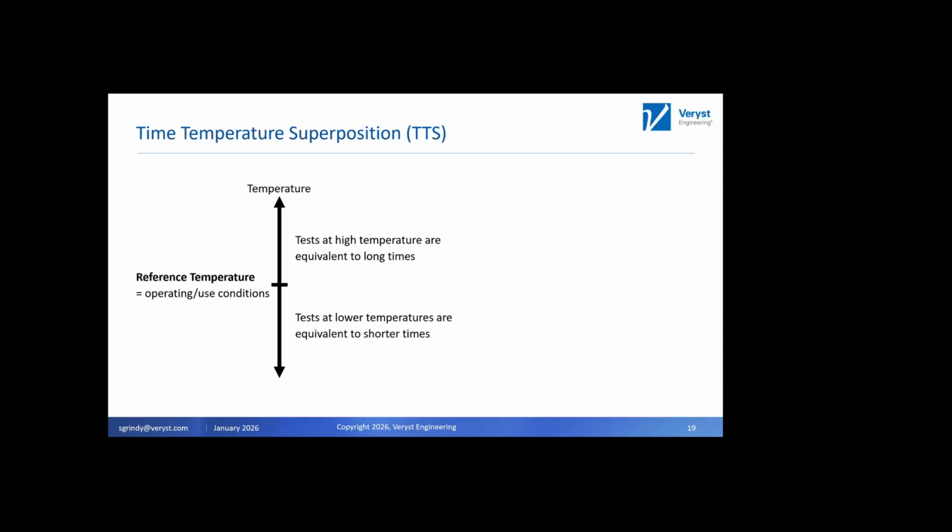Let's see, another new question. What about the loading frequency? Will that affect the DMA? Generally, yes. That's a question of material response. We're going to see a little bit in the next couple slides about how measuring the modulus at different frequencies can be used to our advantage. That's an intrinsic material behavior question. Polymers tend to have time-dependent viscoelastic behavior, and so changing the frequency changes the modulus of the material. So I want to talk a little bit about time temperature superposition.